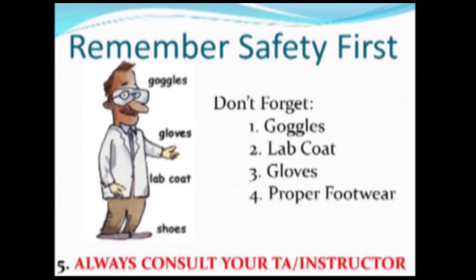Remember guys, safety first. Don't forget your goggles, lab coat, gloves, proper footwear. Common sense might be a good asset too. Before coming into lab, make sure you read your lab. And when in doubt, always, always, always consult your TA.